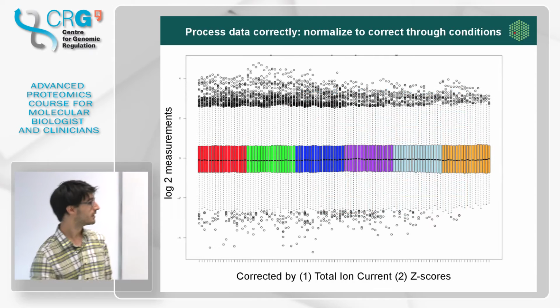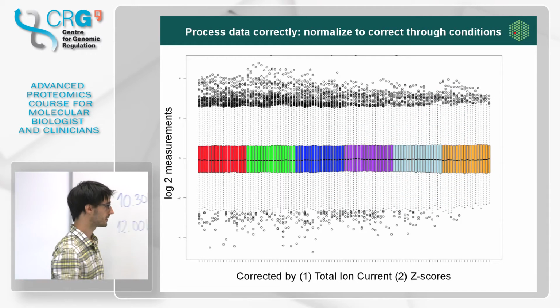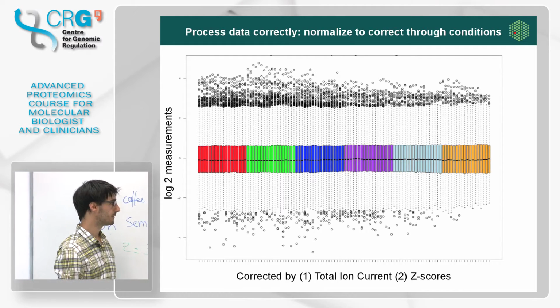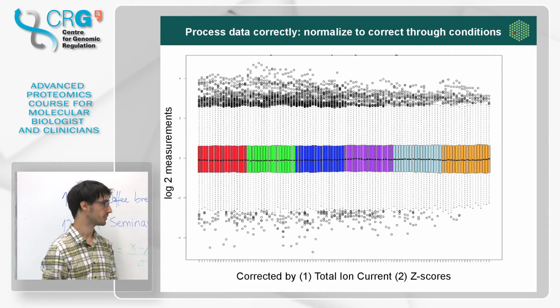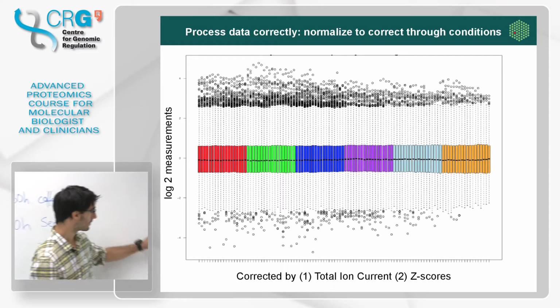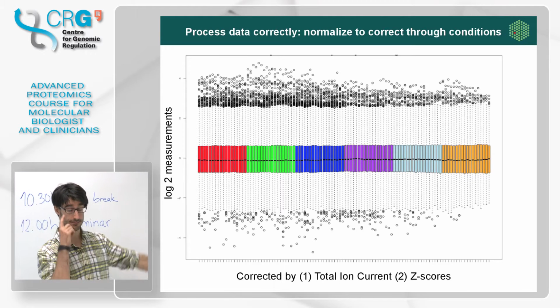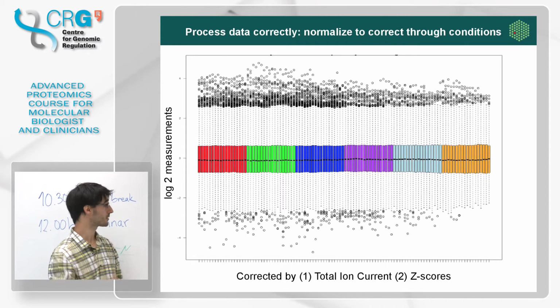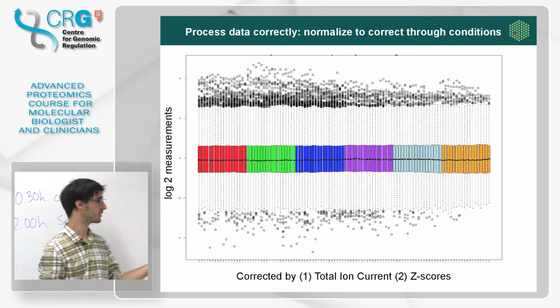Right. So are you familiar with box plots? It's a very useful tool to see the distribution of your data, and there are some different ways or conventions to use them. A box plot, for example, normally shows you the first quantile of your data. The second quantile is normally the median in a box plot, not the mean, which is why that would be my question here to you.